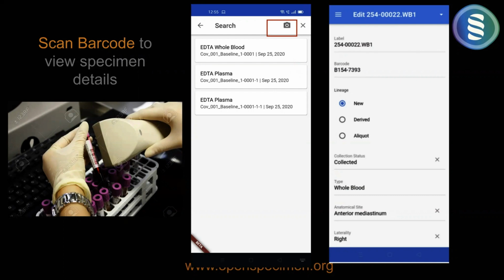In fact, in the upcoming release, that is 10.1, you'll see a lot of new features being added in OpenSpecimen around freezer management. We'll shortly be doing a webinar on new features in 10.1 where we'll talk about it. We added a lot of new features for making things easy around boxes, freezers, scanning, doing things in bulk, and those kinds of things.